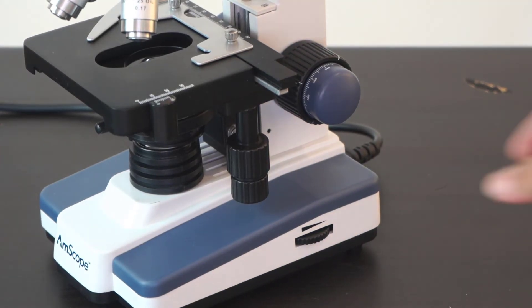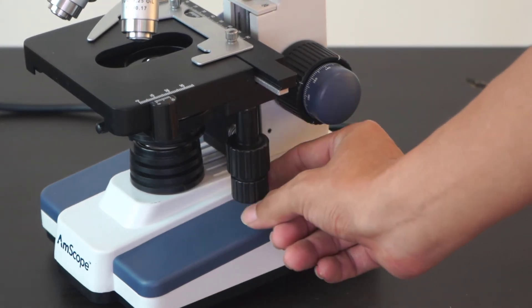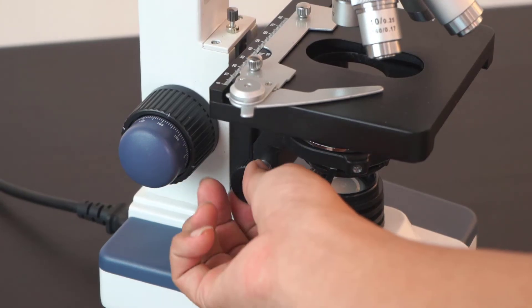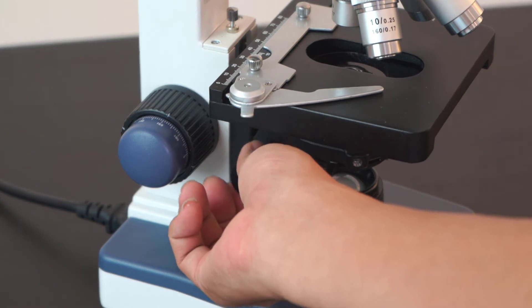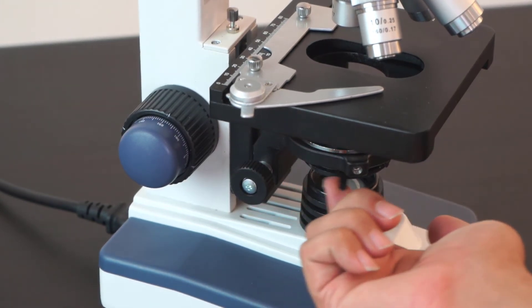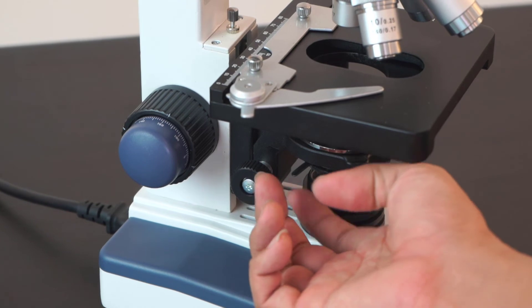To move the stage, you can use the mechanical knob. To control the amount of light hitting the slide, you can use the condenser adjustment knob. To control the background brightness, you can use the iris adjuster.